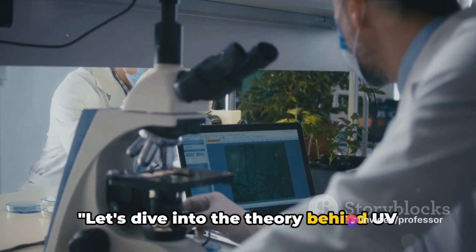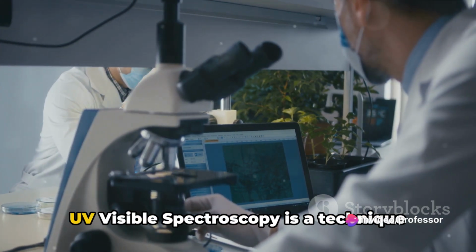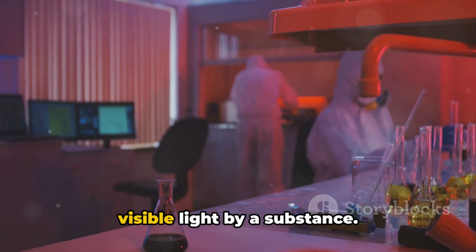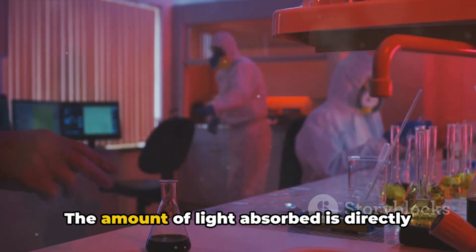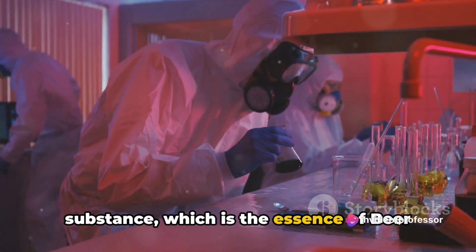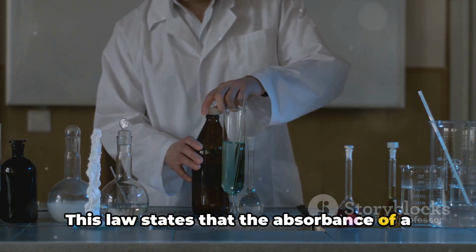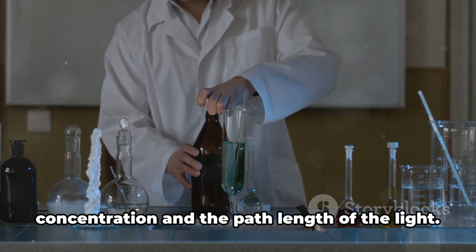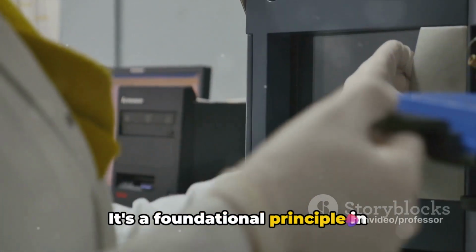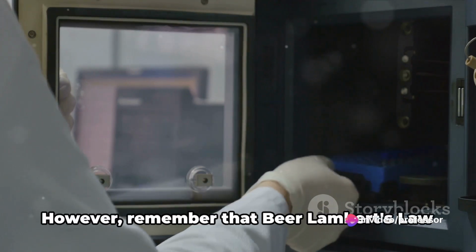Let's dive into the theory behind UV visible spectroscopy and Beer-Lambert's law. UV visible spectroscopy is a technique based on the absorption of ultraviolet or visible light by a substance. The amount of light absorbed is directly proportional to the concentration of the substance, which is the essence of Beer-Lambert's law. This law states that the absorbance of a solution is directly proportional to its concentration and the path length of the light. It's a foundational principle in spectrophotometry, the quantitative study of electromagnetic spectra.